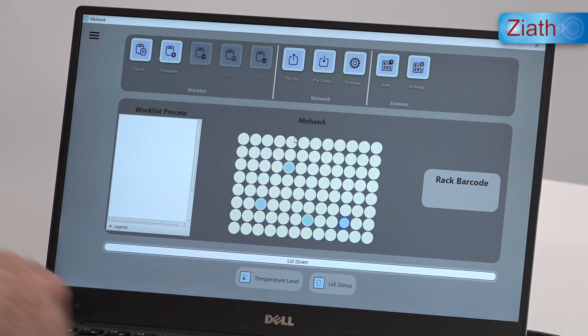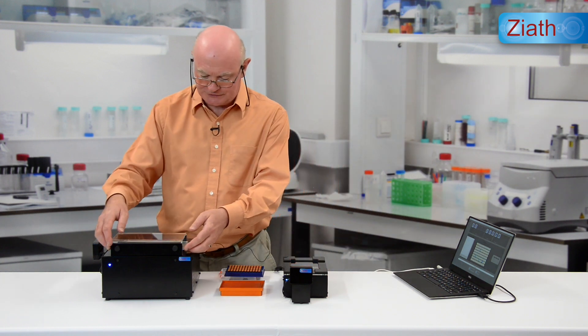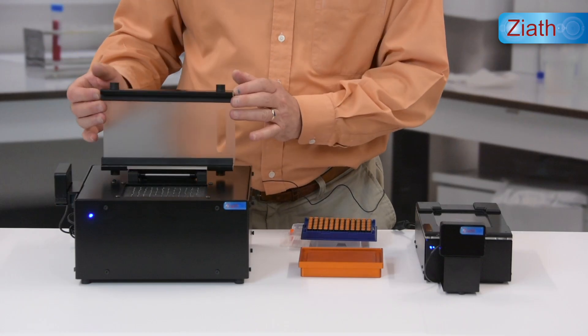When we're ready to pick them we can simply place the rack onto the Mohawk with the special adapter that you can see here.